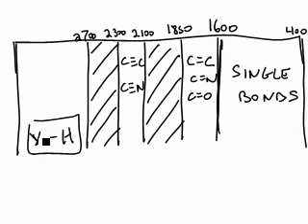Now, granted, this is a single bond. Any bonds to hydrogen are going to show up all the way on this region of the IR spectrum. And this region can be broken up as well. In this region here you have CHs that are just regular sp3 hybridized CHs.